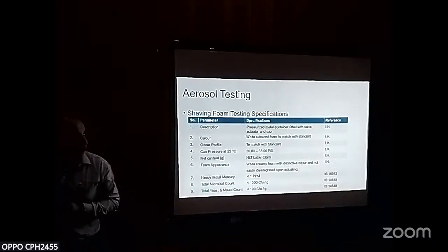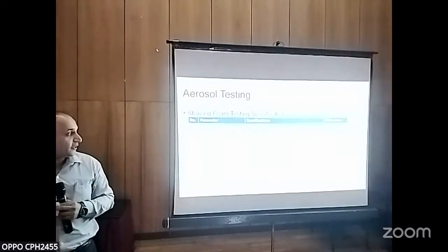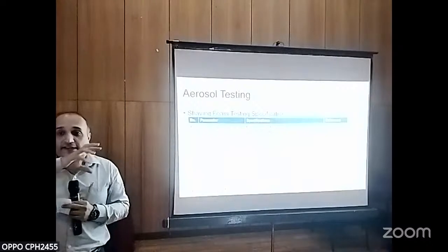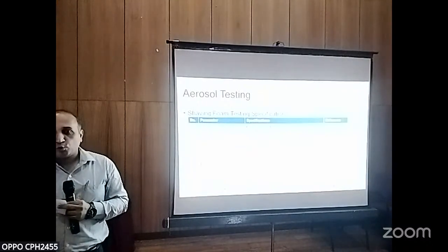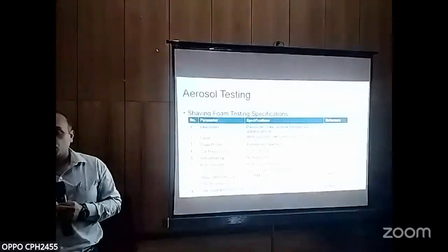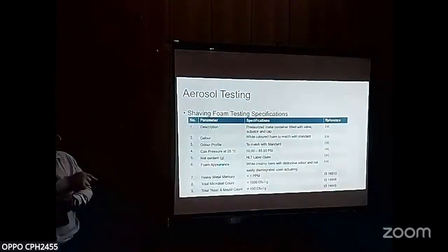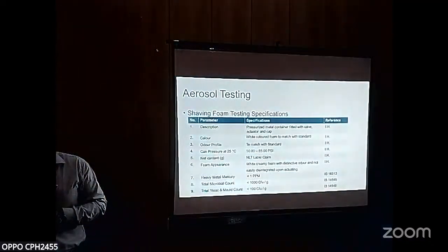So shaving foam is also another category which is very commonly available in the market. However, there are no testing standards available, but what we do is refer to the shaving creams. Shaving cream gives only two basic parameters. One is the total fatty matter, which has to be around 20 to 40, and the next is the microbial estimation.